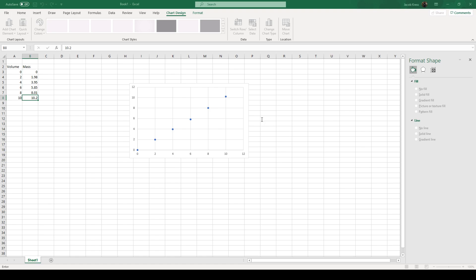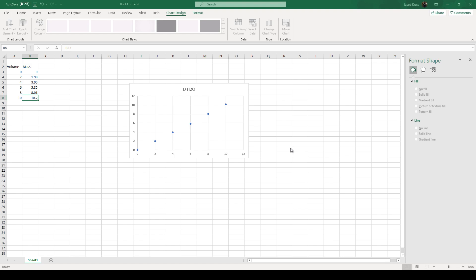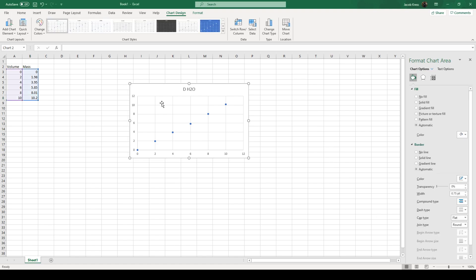Now if you want to name this series you could call it whatever you want, d H2O and we're going to hit OK. So you guys are going to see it already it auto titled that for me. We're going to go back and fix a couple things.